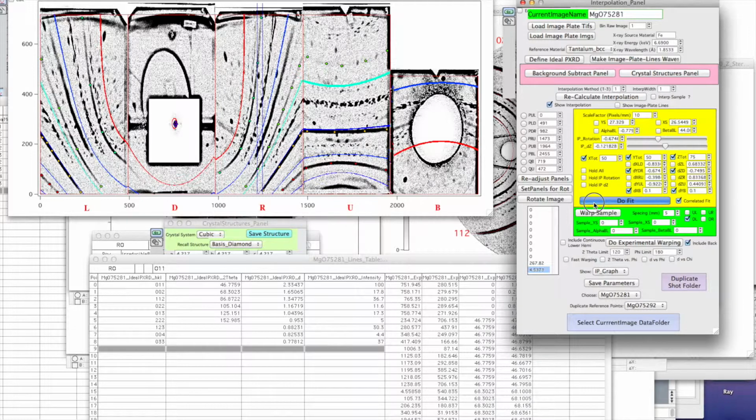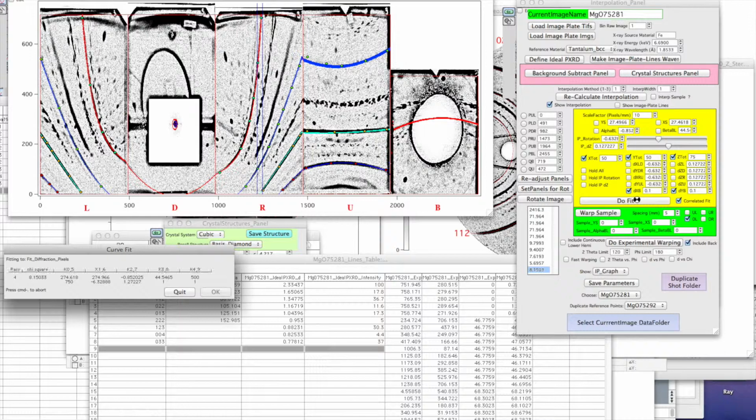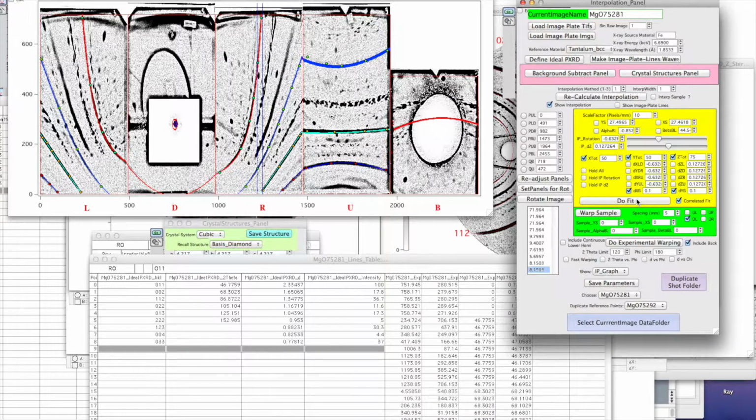So one question I had is, all of these, I know these are basically some kind of holding the image plates in terms of rotation and moving them around somehow. Is there some things that you always hold? No, you shouldn't hold those two here because those define the straight through, the coordinates of the other one. And then there is no physical reason for having a correlate fit. Might be better. That moved it a little bit, yeah. That moved it better, okay. Yeah. And then I guess I could try it with and without these, right?